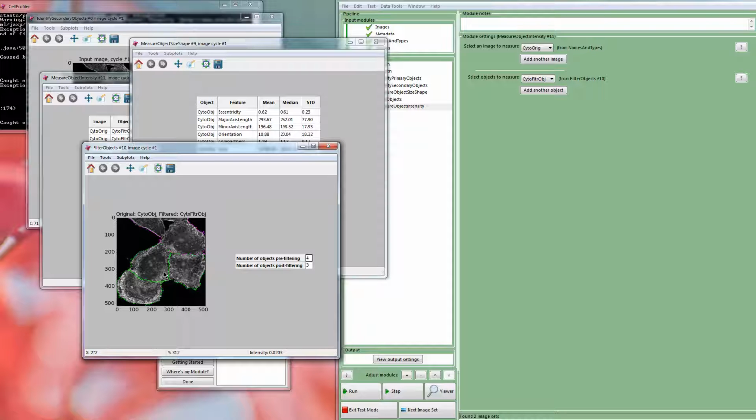It's nice to do a couple of things in Fiji as a sideline, just to give you some controls, just to verify that bit is roughly this kind of intensity or roughly this size, etc. Make sure things work properly.